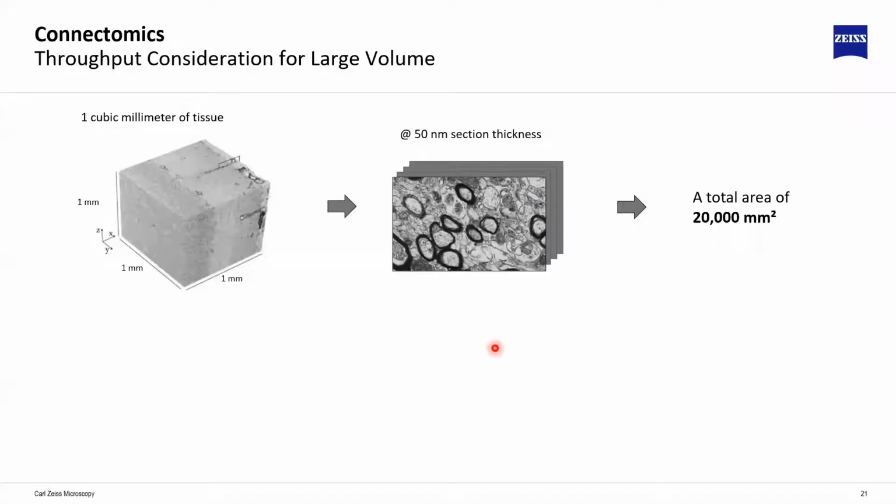So that brings me actually to the next step. Why do we have to limit the area that we want to image? Well, it's a fairly straightforward problem. Our electron microscopes, since they are scanning electron microscopes, take some time to scan over a certain area.